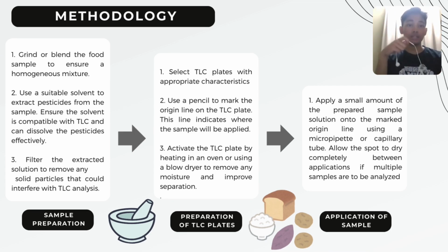Okay, next we have application of sample. Apply a small amount of the prepared sample solution onto the marked origin line using a micropipette or capillary tube. This allows the spot to dry completely between applications when multiple samples are to be analyzed.